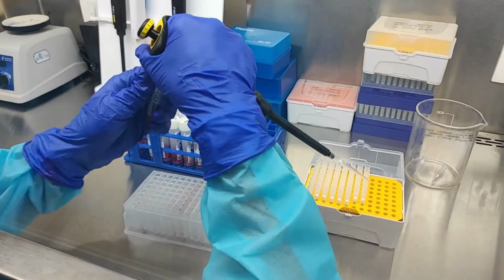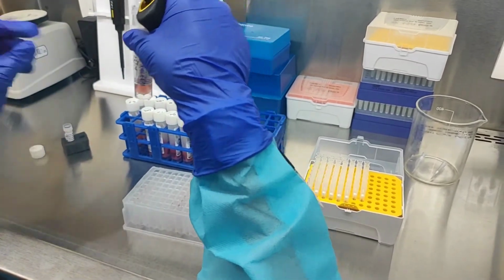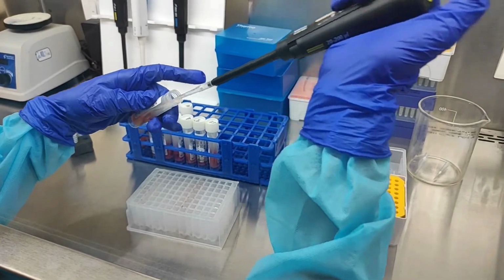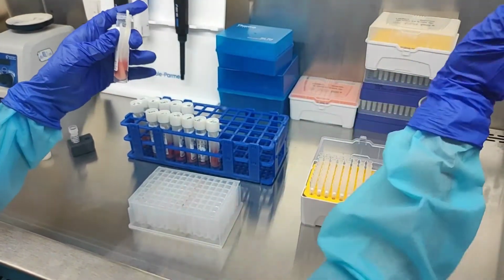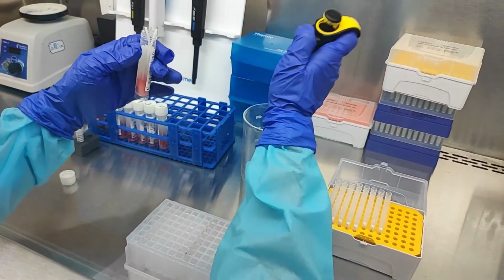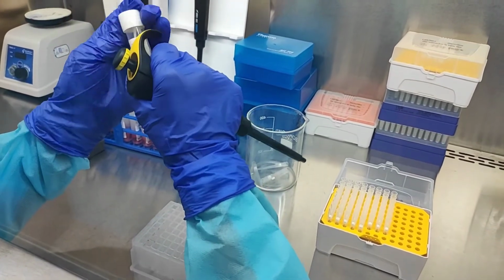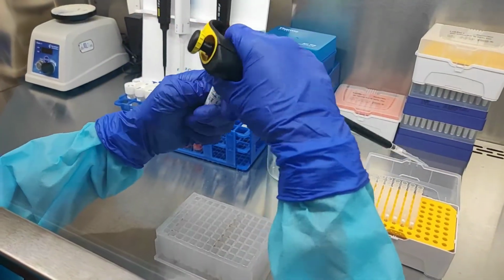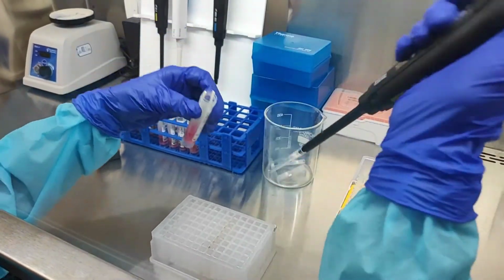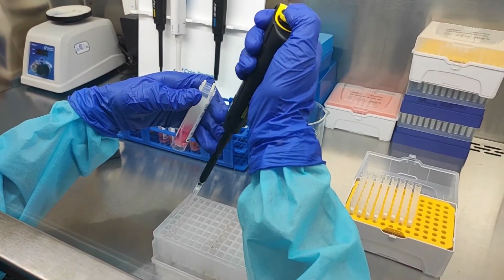All samples may contain potentially infectious materials. As such, all procedures before the RNA extraction is complete must be performed in a biological safety cabinet. A biological safety cabinet is specialized to provide environmental, product, and personal protection. We have to load the first row and the seventh row of the plate with sample and carrier RNA.